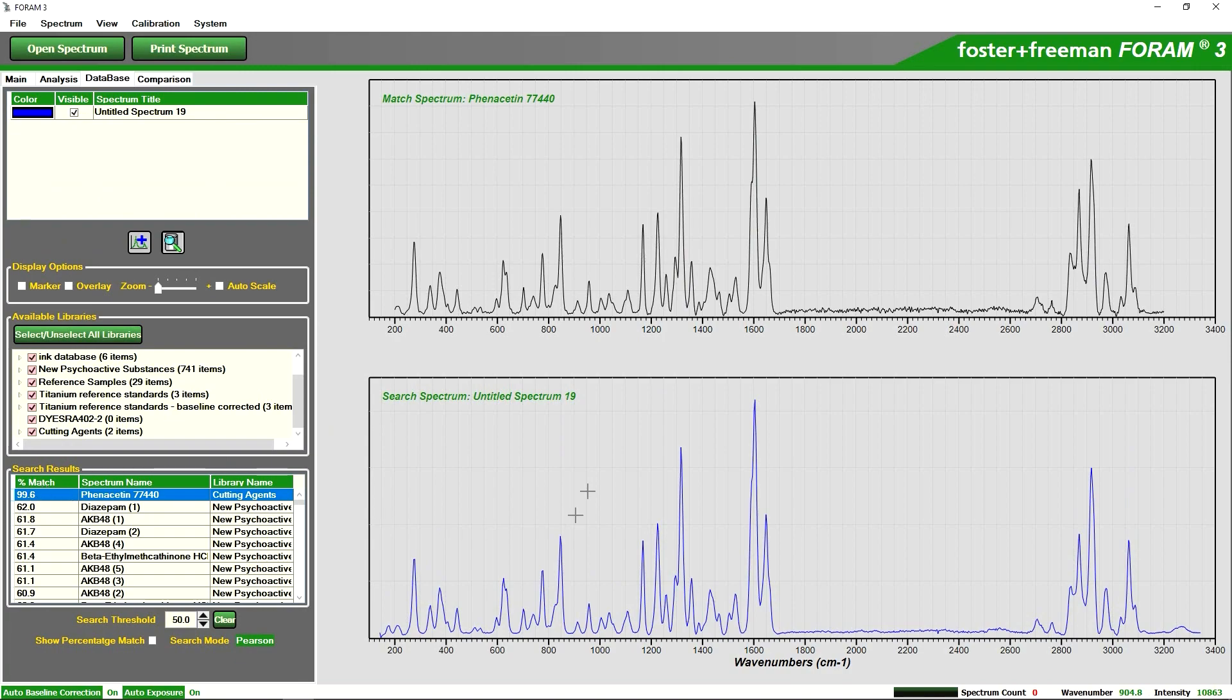The blue spectra at the bottom is our unknown sample and at the top we have our reference spectra of phenacetin.